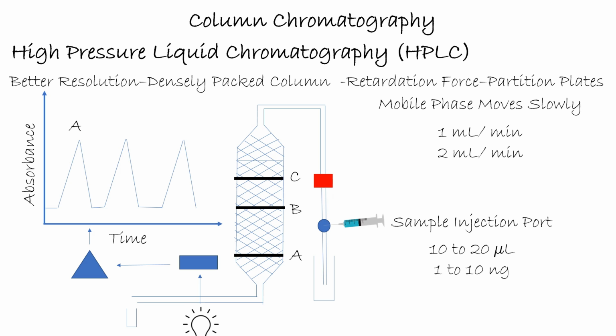After some time, we will get peaks for B and C. So at the end, we have the retention time of these compounds. And by matching the retention time with standard compounds, we are able to identify these compounds, as well as separate and quantify compounds based on the absorption value. More absorption value means more concentration and lower absorption means low concentration.